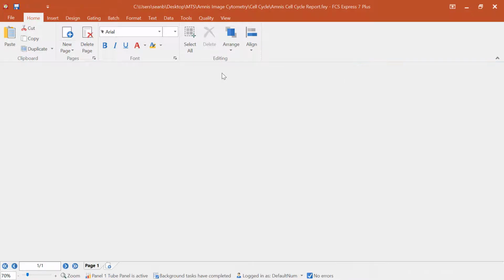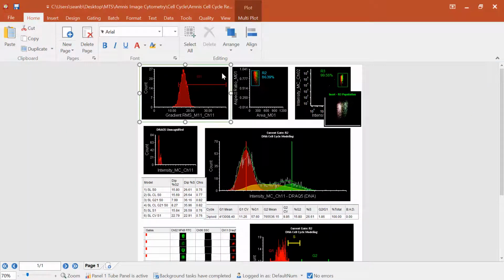But really importantly, when you're analyzing just about any sort of image cytometry data, there's usually some sort of nuclear staining component to it. The reason for that is you need to quickly identify what is a cell. Every cell has a nucleus, at least for a lot of the biological data that we're working with here.